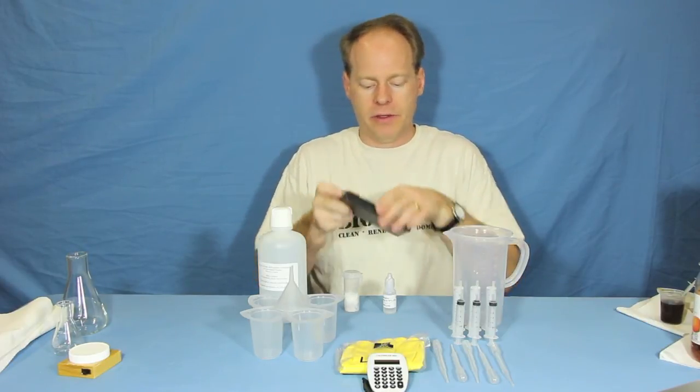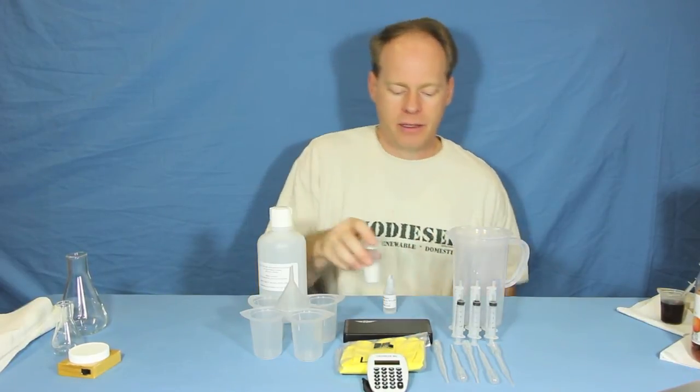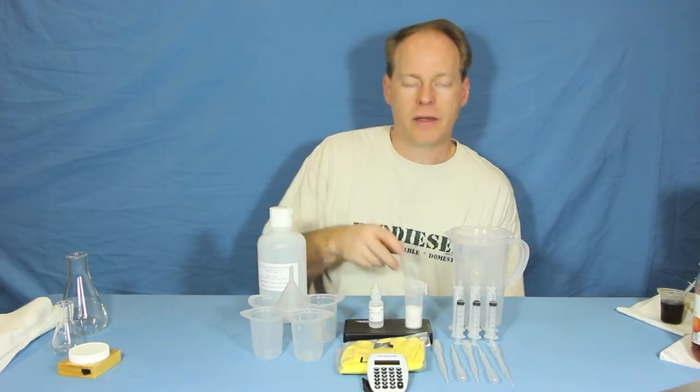So if you're looking to get into biodiesel and you want to start off right, be sure to pick up one of our titration kits — either the basic or the deluxe.